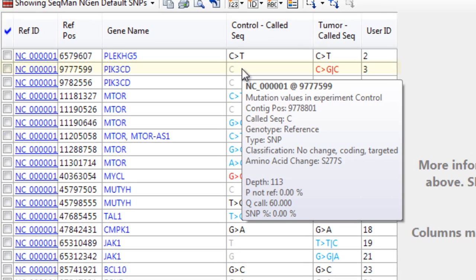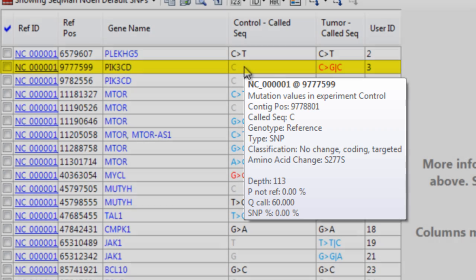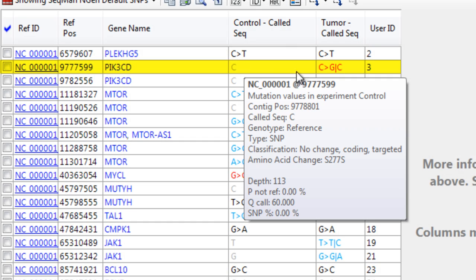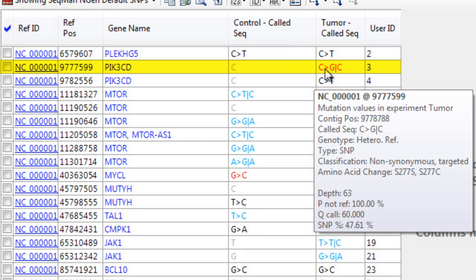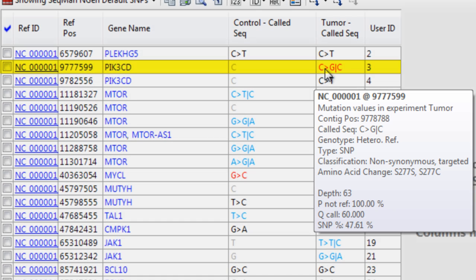If we hover over this SNP, we can see that it matches the reference sequence in the control assembly, but leads to a non-synonymous amino acid change in the tumor assembly.